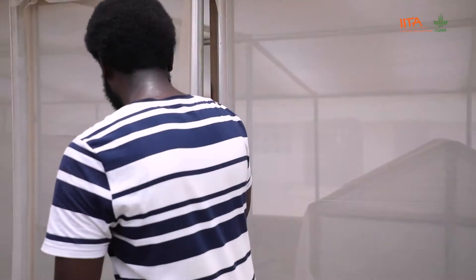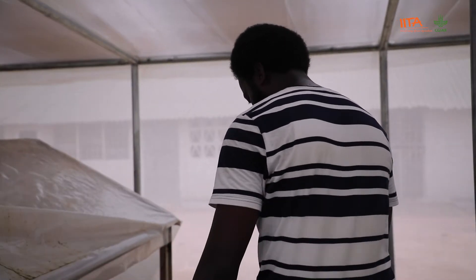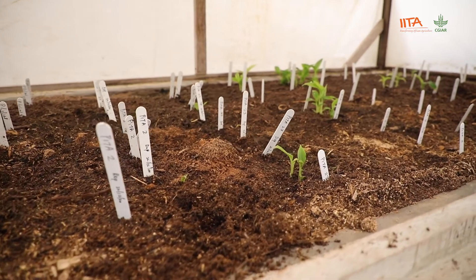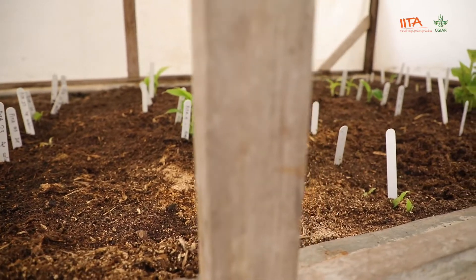Thank you, Dr. Delphin. I'd like to show you some activities happening in our humidity chamber. As you can see, we have about four humidity chambers here, with a capacity of about 200 combs that could be planted. The first thing you do is go to the field and get your sword sucker or a maiden sucker — a short sucker. Those are the two types of suckers you can naturally use.